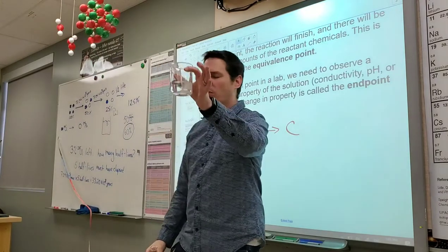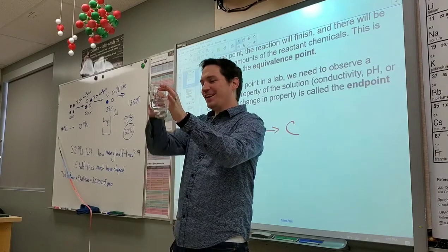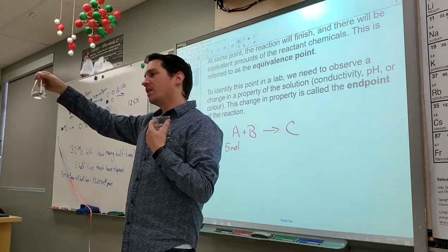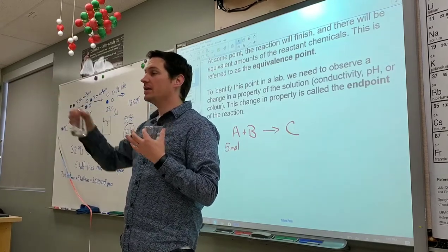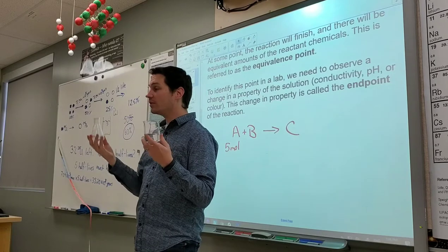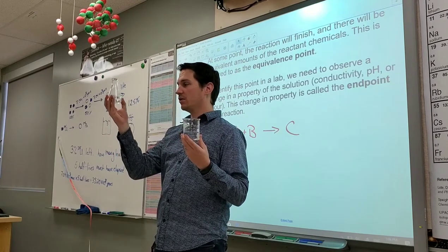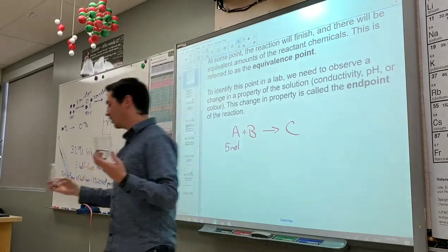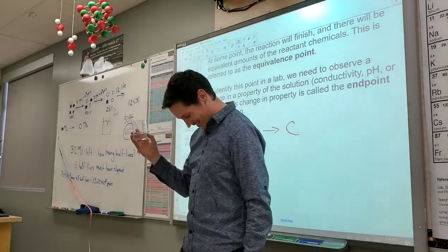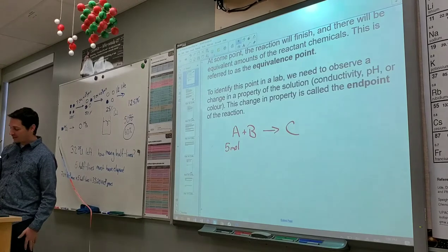Okay, here's the beaker. What shape do the walls of the beaker make? Cylinders. Yeah, they're curved around, obviously, in a cylinder, and they're straight up and straight down. And what about an Erlenmeyer flask? They're angled in, in a conical way, right? So one of the only reasons why Erlenmeyer flasks exist is that if I swirl this, is anything coming out? No. And if I swirl this, is anything coming out? No. So there's a very specific reason for having an Erlenmeyer flask.